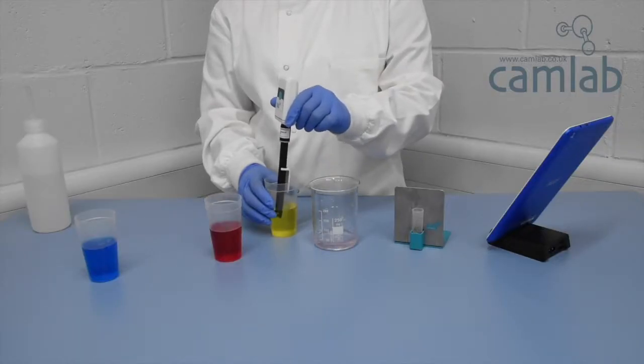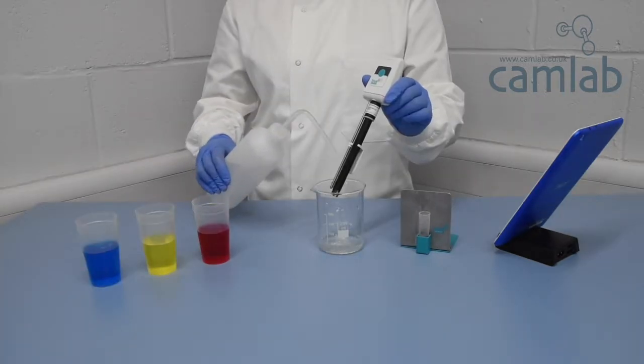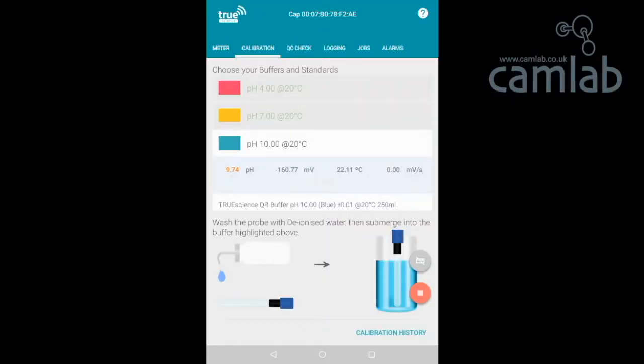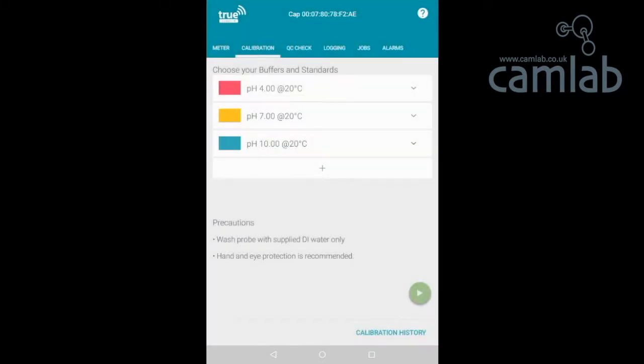Repeat until all buffers have been used, rinsing the electrode between each reading. If the icon does not turn green, replace your buffers and ensure your rinse step is adequate. Once all buffers have been used, a message will appear showing the completed calibration results and electrode health. Touch Keep to save the calibration and return to the calibration screen.